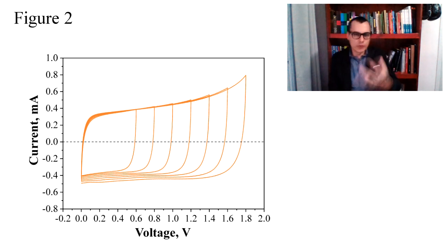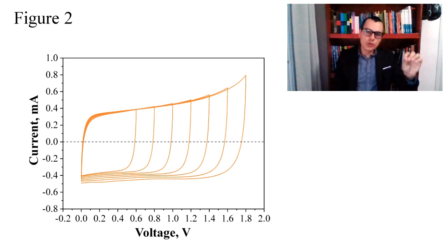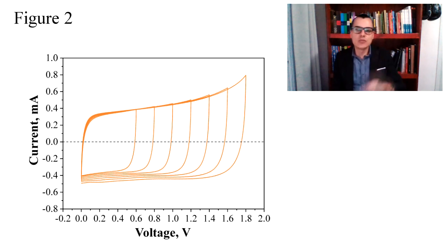In the case of Operando studies, during the acquisition of the Operando Raman spectra, one cyclic voltammetry was performed with a scan rate of 1 millivolt per second. The Raman spectroscopic acquisition time for each spectrum is 6 seconds and 2 accumulations, and each Raman spectrum was acquired within 0.2 volts.